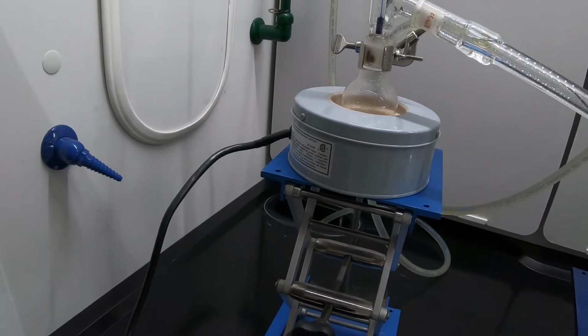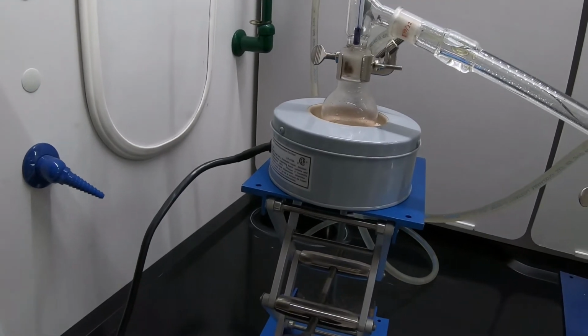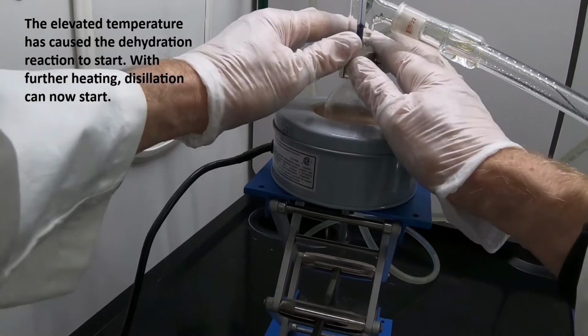Safety alarm, the sash was up too high. So, at this point, the reaction has been warmed. It's not boiling, 5 minutes at an elevated temperature, not actively refluxing yet.